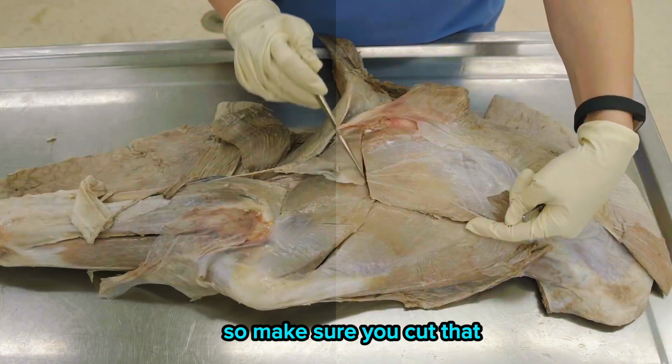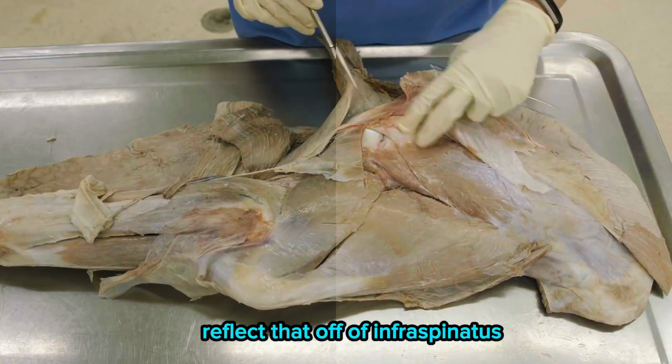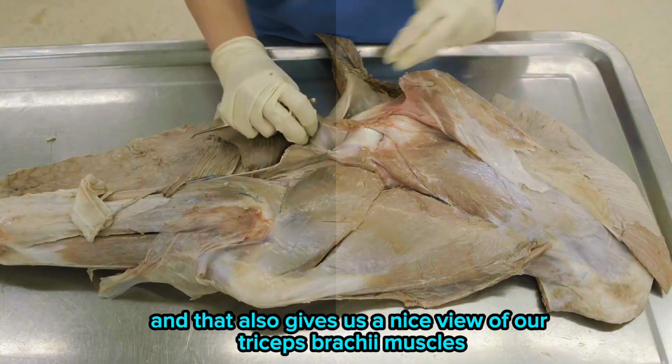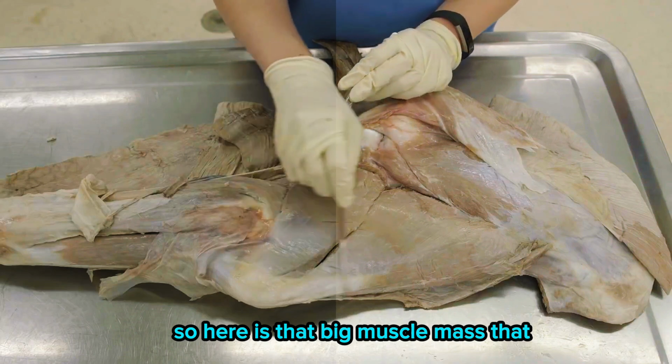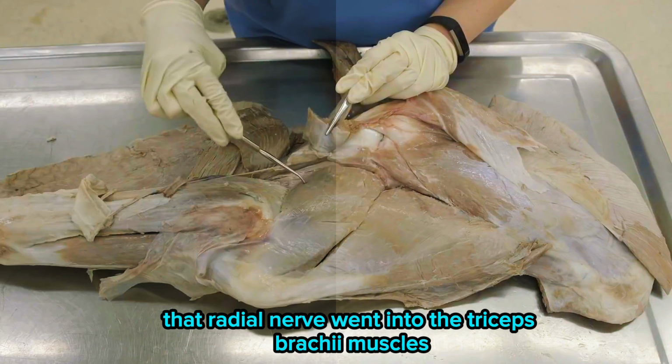So make sure you cut that. So cut deltoideus straight across. Reflect that off of infraspinatus, so you'll be able to see that. And that also gives us a nice view of our triceps brachii muscles. So here is that big muscle mass that radial nerve went into, the triceps brachii muscles.